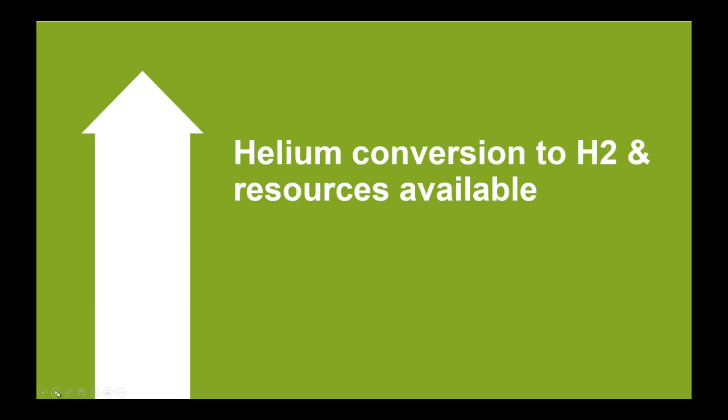So a couple of points on helium conversion to hydrogen. I'm sure that there may be some of you on the webinar today who are interested in this. We do have a number of pieces of information available on our website, but I just have a couple of slides on the key things that you need to consider before changing to hydrogen from helium.